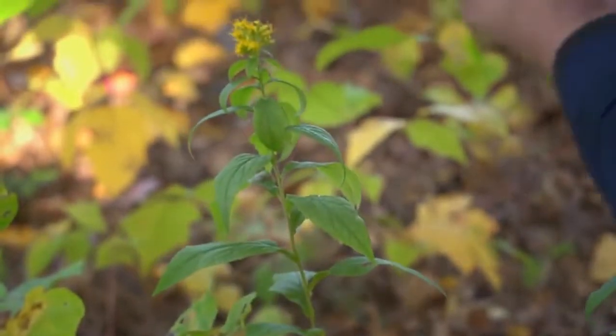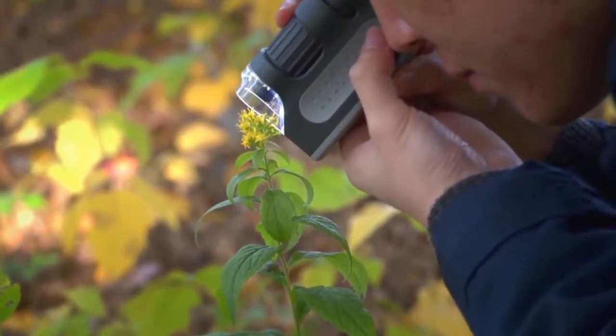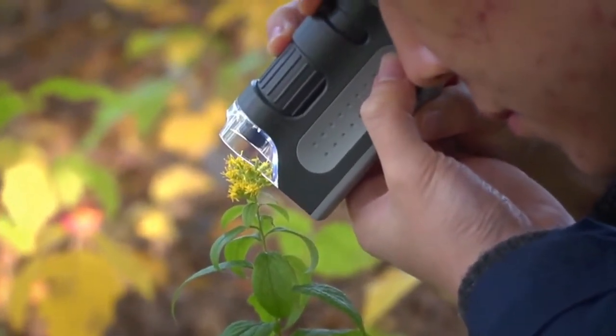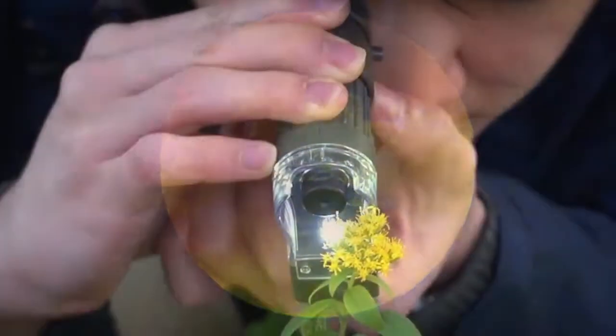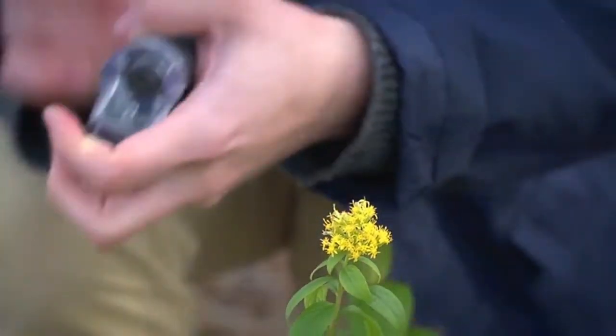This is one impressive little microscope. It actually has a range from 60 to 120 power which is huge. With this you can see things that the naked eye just can't. If you enjoy looking at plant life or need a microscope that you can travel with, the micro bright works outside and can be stored right inside your pocket.